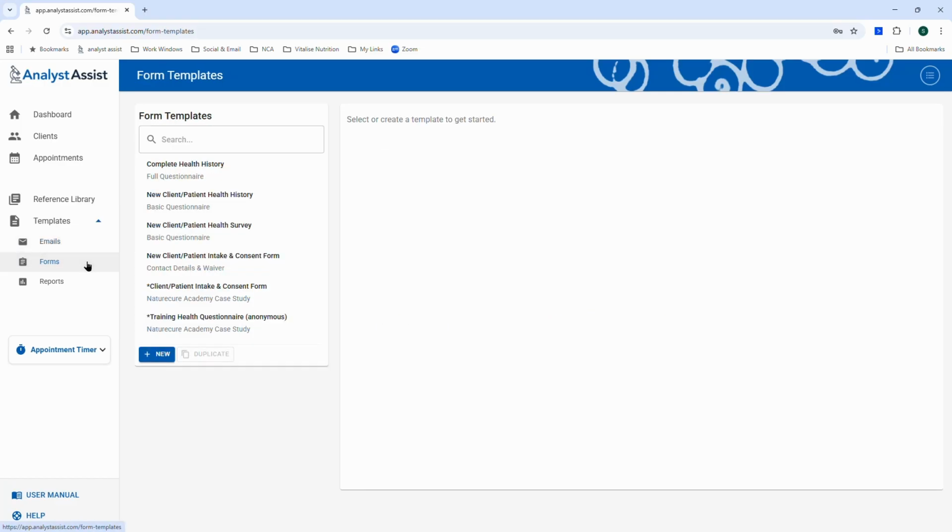Digital forms are how you can request information from your clients, which is then automatically stored in their client record for easy access. Every digital form that you send is based on a form template that is stored on this screen. Forms can include field tokens that are swapped for existing record data when the report is opened, and client fields that automatically update the fields in their client record on submission. Generic text, date, or other types of field for gathering general information are also available.